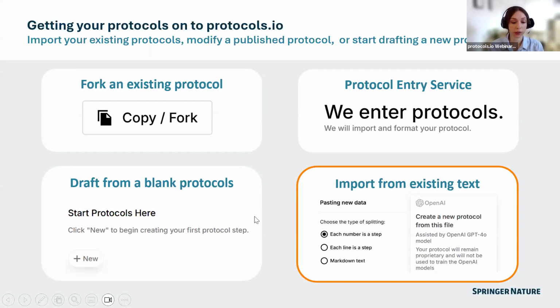You can then, of course, draft a protocol from scratch in our protocol editor. And then you can import from existing text that's been drafted. This is relatively new over the past year. We've created a new AI protocol importer, which I'll show briefly in a second, which means that if you already have a method drafted in a Word or PDF format, you can import that, and the AI importer will convert that into the dynamic stepwise format in protocols.io.